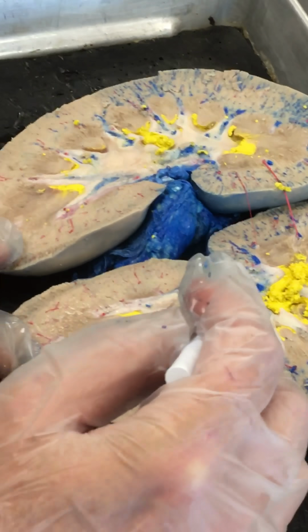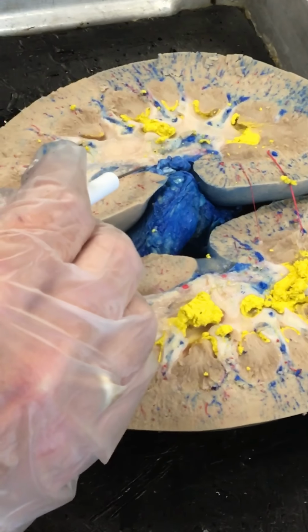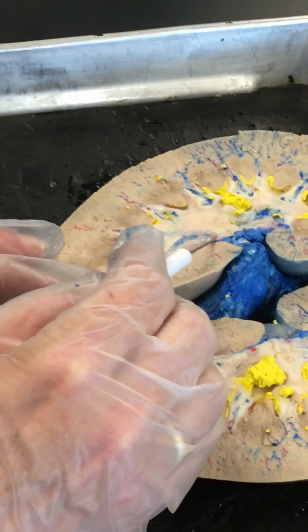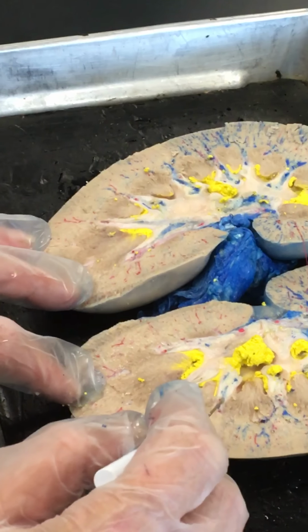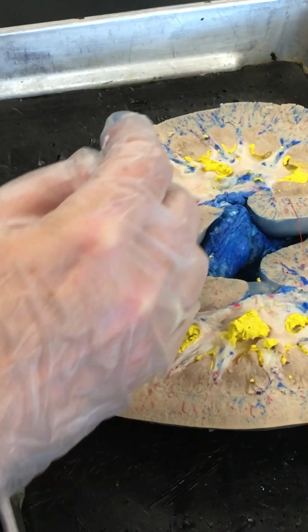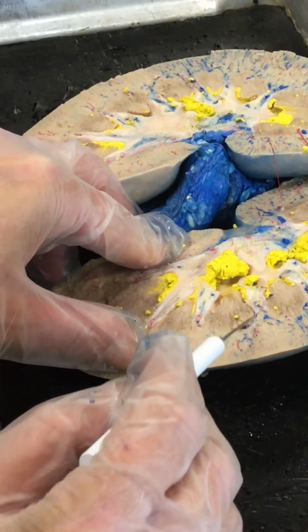When we follow our blood vessels, the renal artery enters into the kidney and branches off to form the segmental arteries. The segmental arteries branch to form the interlobar. So in each column, there will be an interlobar artery coming up through the column. The arcuate tend to form a line right on top of the renal pyramids. So this one doesn't have any really great arcuates.